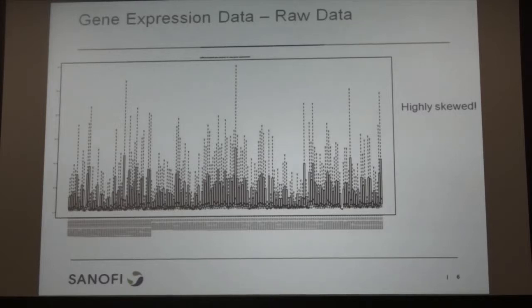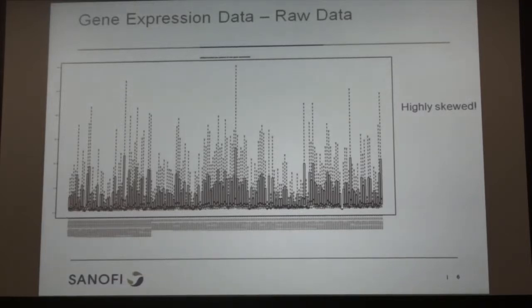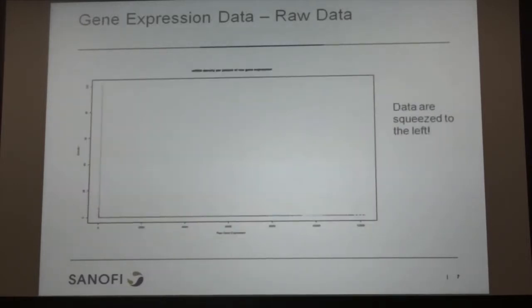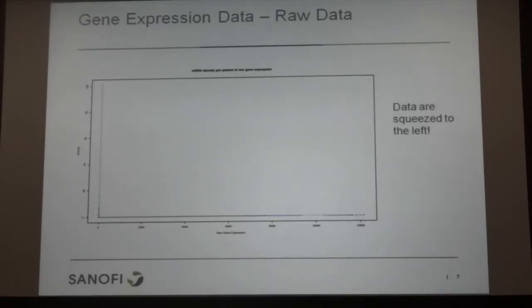First we plotted this data. You can see there are many box plots — each box represents all the genes within one subject. The first few are patient gene expression and the rest are healthy controls. They are highly skewed: the mean is all towards the lower end, and if you plot a density plot, almost all values are concentrated around zero. This is clearly not the right data to begin analysis on.